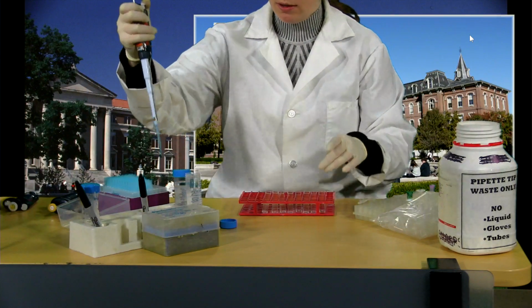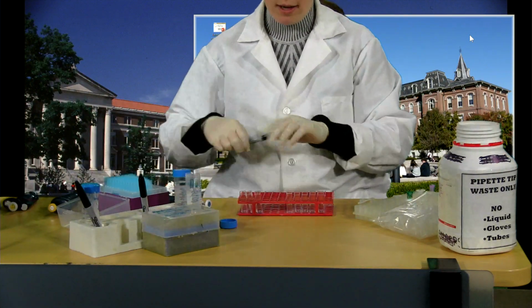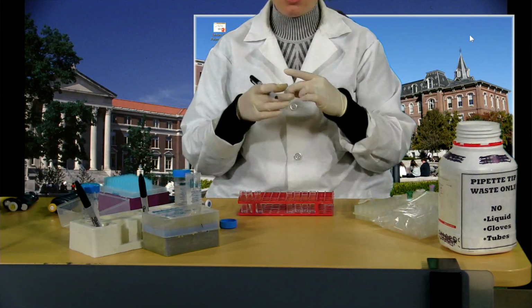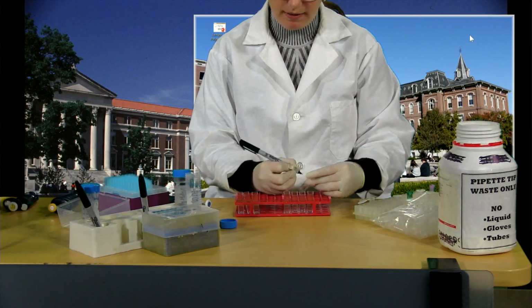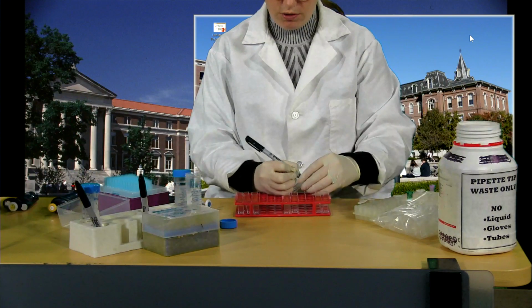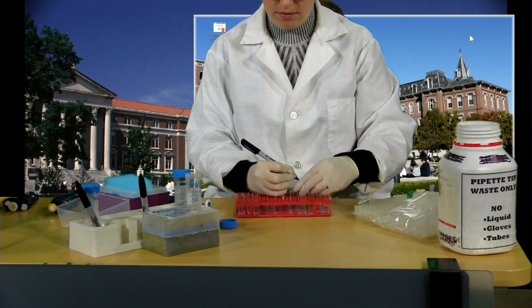And I'm going to need, you know what, before I do that, of course, I should probably label these up. I'm going to need 5 cuvettes, so let's just put these to the side. I'm going to go ahead and label these. And again, as always, try and minimize your handling of cuvettes, guys. Make sure that when you handle them, it's always near the top. Any sort of writing on them should go near the top. And use the same labeling that you used on your assays. So purified 1 in 10, crude 1 in 10, and blank.